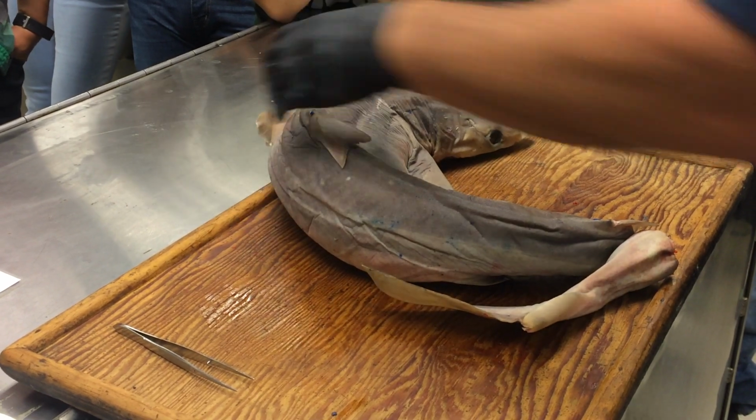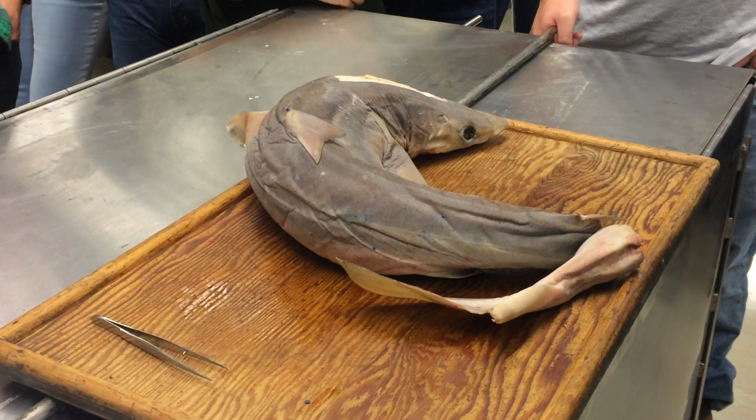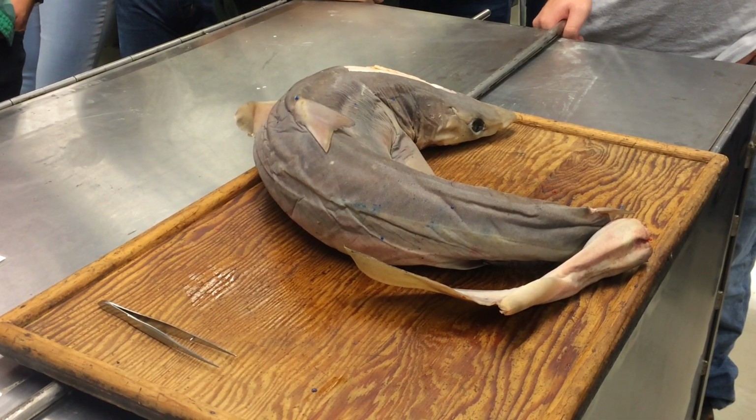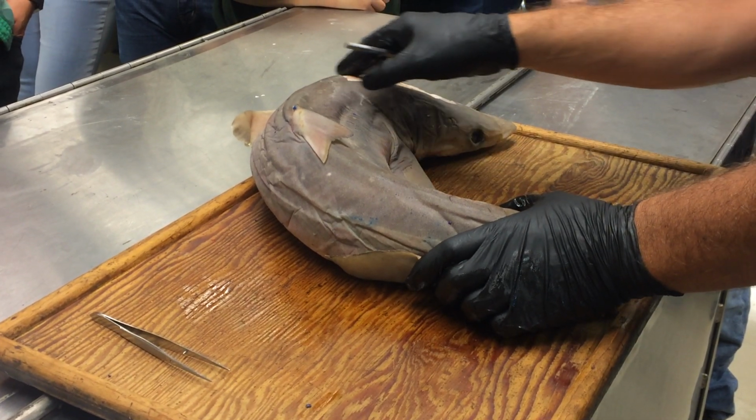That's the cucularis. So there's scapular cartilage, cucularis. And the cucularis is homologous with the muscle in us called the trapezius, which is basically doing the same thing. It's attaching onto the pectoral girdle, onto the scapulae. So we'll follow that one along. That's cucularis.